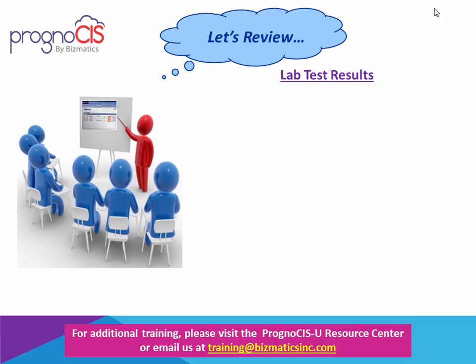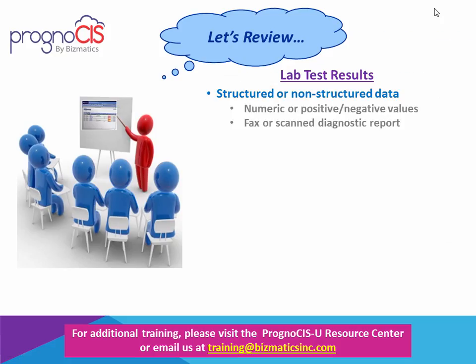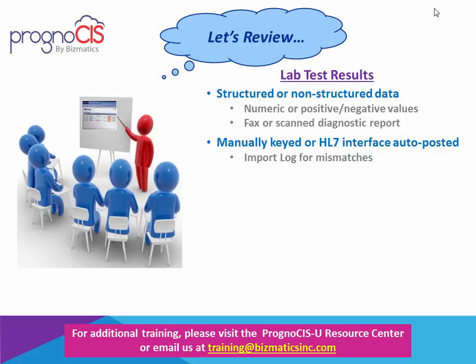So in review of our lab test results and then Prognosis, the data when posting a result can be either structured data or non-structured. That, of course, means that it could either be in the form of a numeric result within the context of a minimum-maximum range, or it could quite simply be positive-negative. In the case of non-structured, that would be an example where the diagnostic report has come in by fax or scan.